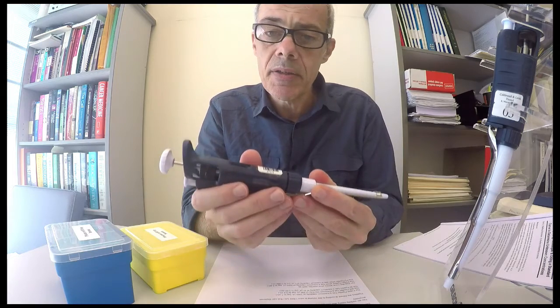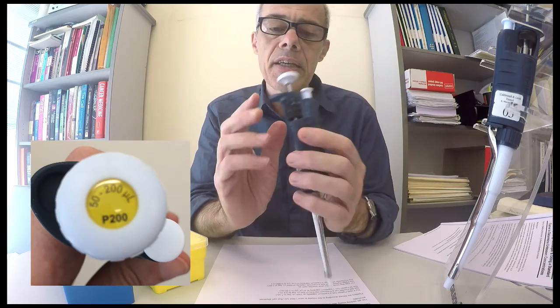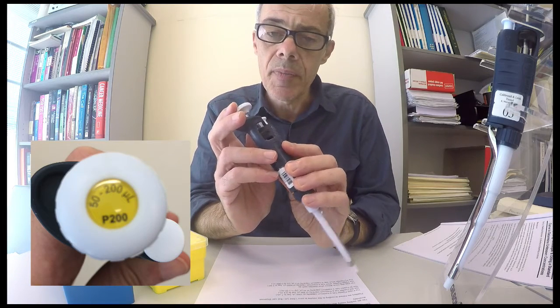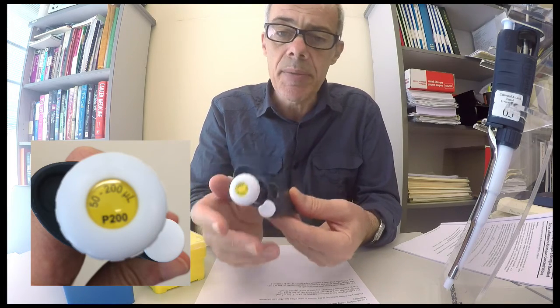This P200 can dispense 0.2 of a millilitre. So if you look at the maximum volume it can dispense, it's 200 microlitres, which is the same as 0.2 of a millilitre.